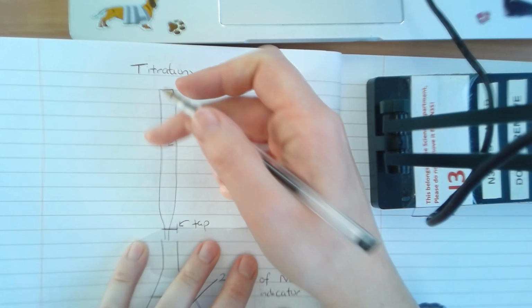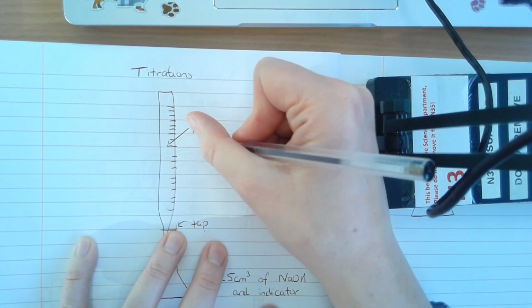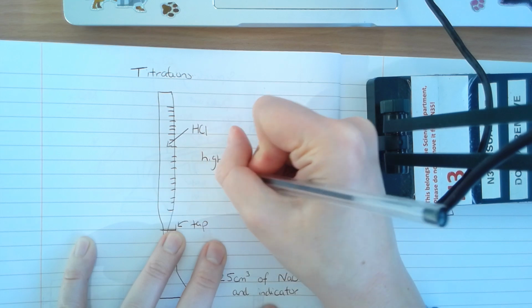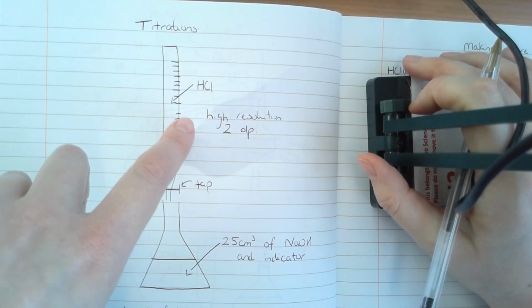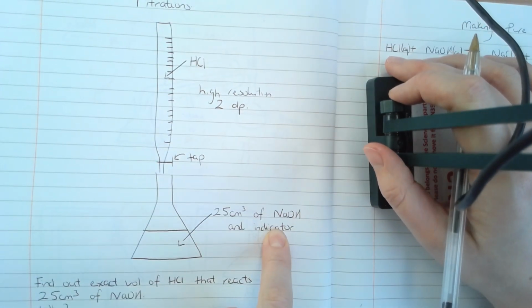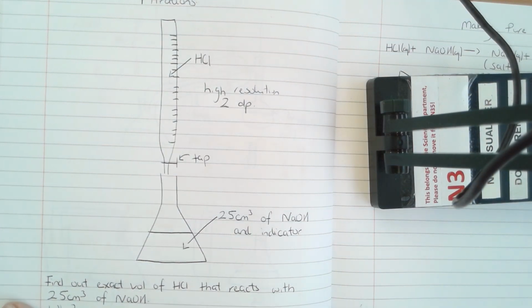If you look at a burette, it's got lots of what we call graduations going the whole way down the side. So we say it has a high resolution, because with the burette you can record volumes to 2 decimal places. So I can say I've added 24.25 centimeters cubed, and I know that to 2 decimal places. So when I remove the indicator and I go again, I know I'm adding the right volume of HCl to bring about that change.